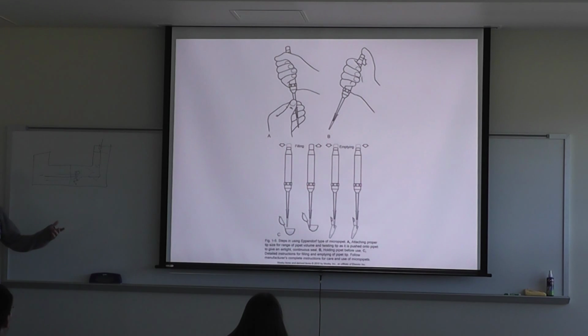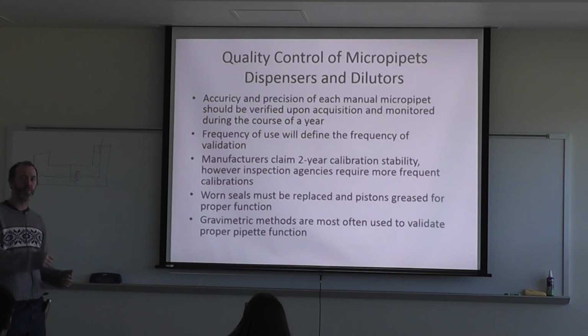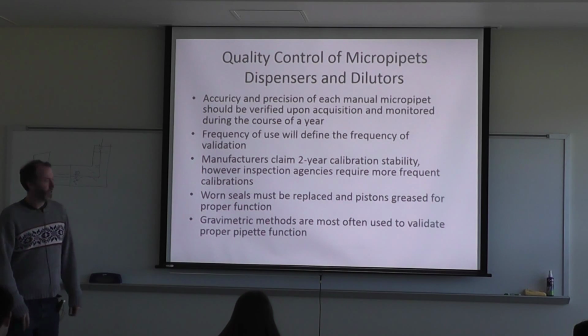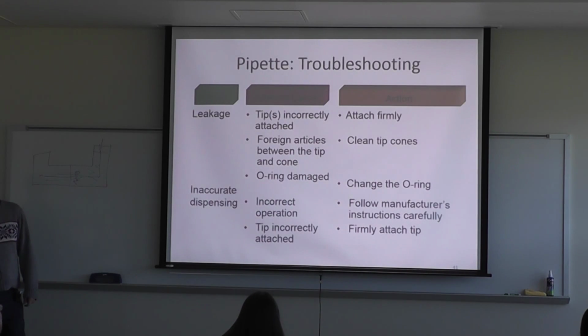And these pipettes we've all used, right? So you know proper pipetting techniques. Has anybody ever done quality control for micropipettes? Yeah, you measure the weight of them at the different volumes and make sure you're within 10% or so of the volumes. Otherwise, you have to take them apart. Typically in a lab, you'll hire somebody to do it. You can do it yourself, but you have to have the balance. They're super expensive, really fine balances. So you either send them out, or a lot of times people will come here and do it. And these are just the steps to go through with those.